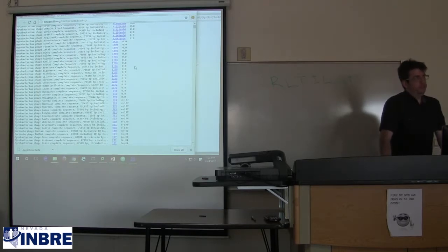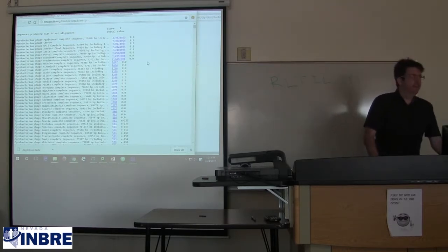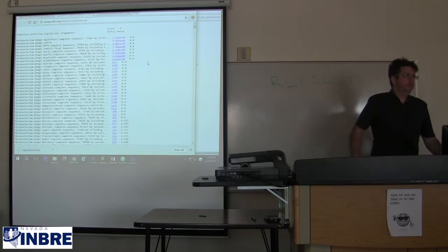Zero would be perfect, theoretically. It's not necessarily theoretically perfect, and we'll be able to see that when we go look at LeBron. We know that there are differences, but according to the statistical analysis, it's giving us a 0, which means it's super good. It's very, very similar.